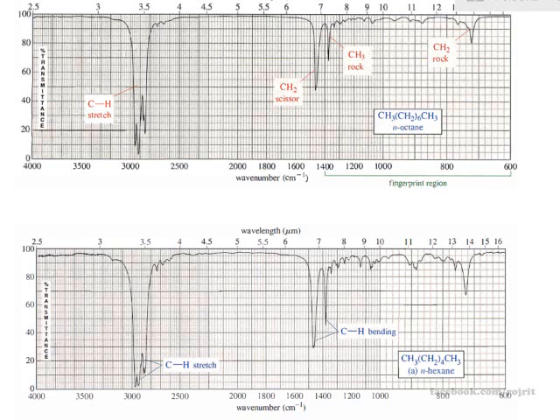We're going to look at the IR spectra for the interpretation. The first two examples shown here are the IR spectra of alkanes. The first compound is octane and the second compound is hexane. So they are quite similar.